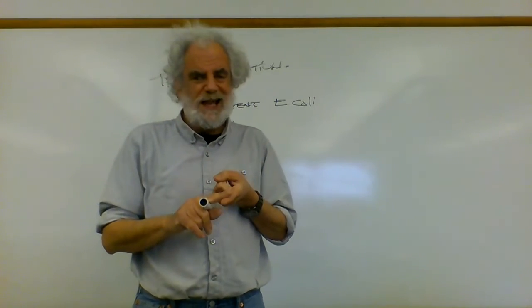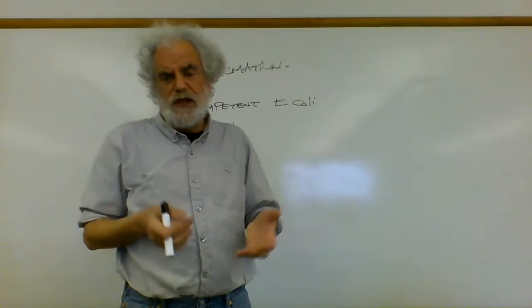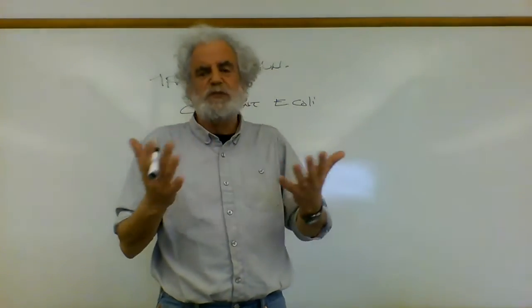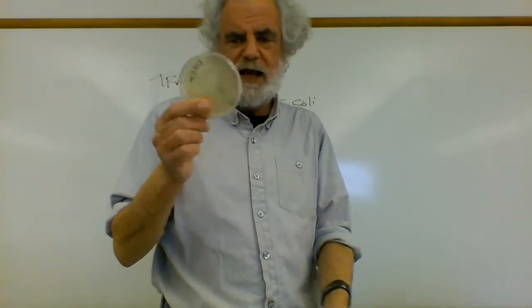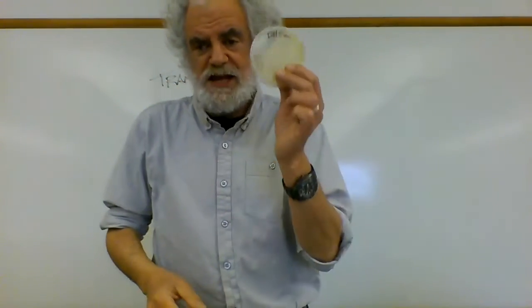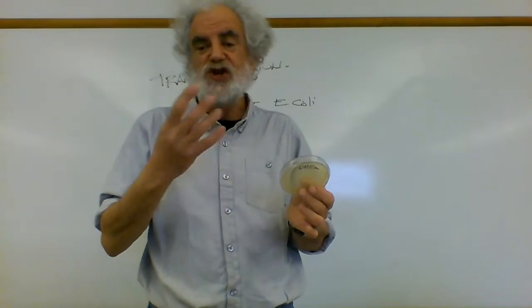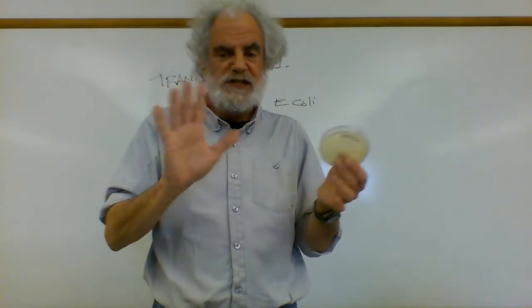They're fairly delicate when they've been treated with calcium chloride. They start to get some holes punched into them. So we're not going to do that. We're going to do a simplified procedure in which we take a plate of bacteria, and allow me to introduce you to my favorite bacteria strain, DH5 alpha. DH5 alpha, meet everyone. DH5 alpha is a phenomenally engineered strain of bacteria that allows for lots of easy manipulation of DNA.